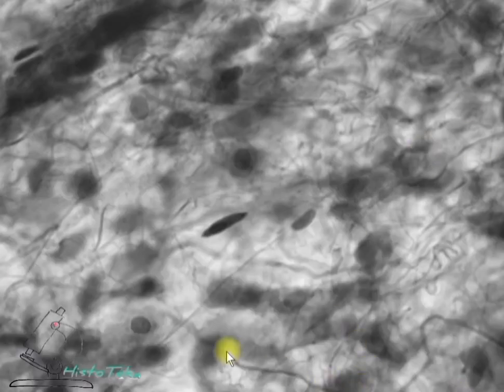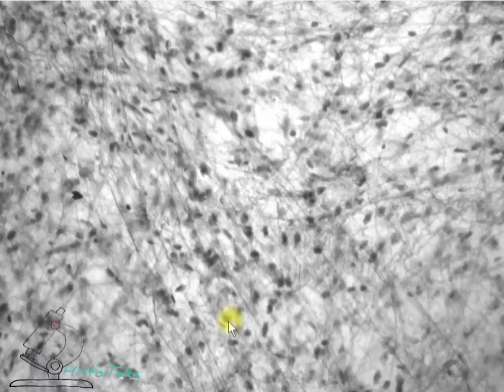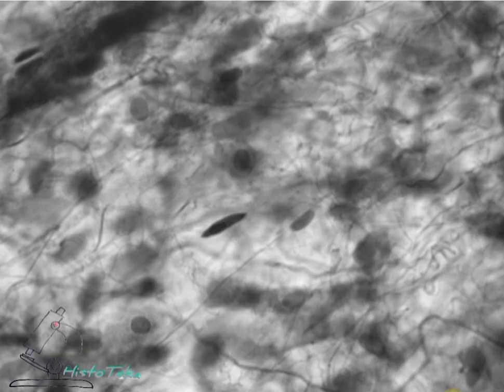Fibers are loosely arranged and go in different directions, which is why the tissue is called loose, irregular. But since there is no regular loose connective tissue, the word irregular is omitted. A wide variety of cells of loose connective tissue are divided into two groups.